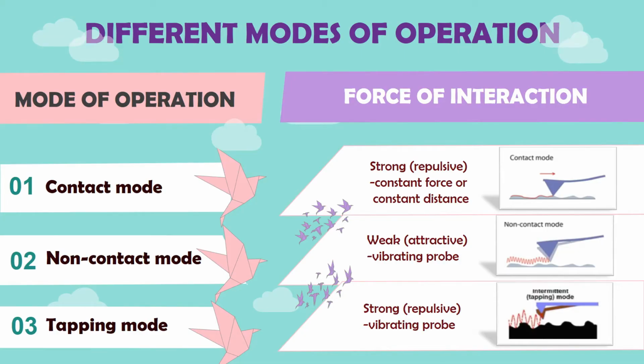There are different modes of operation, of which the first one is contact mode, where the force of interaction is strong. In non-contact mode, the force of interaction is weak, and the last one is tapping mode, where the force of interaction is also strong.